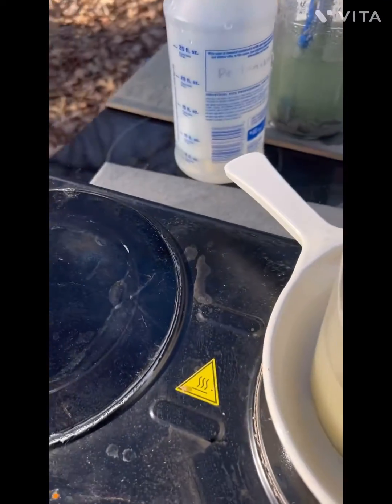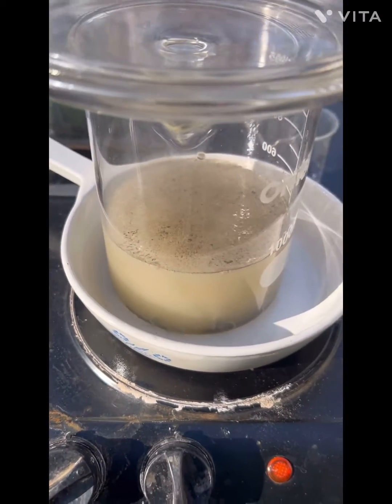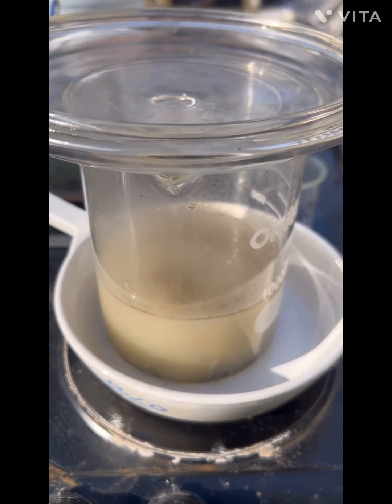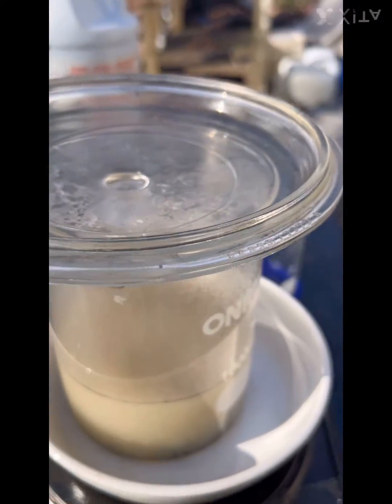We're going to cover it on low heat. I've got a soccer game so we're going to let that cook for a while, and hopefully we're going to make this today. If not, I'm done with it.